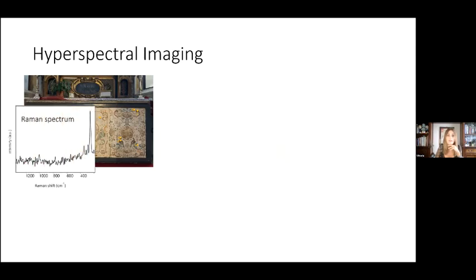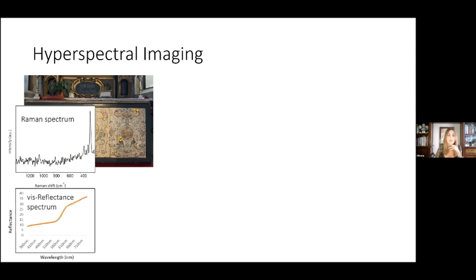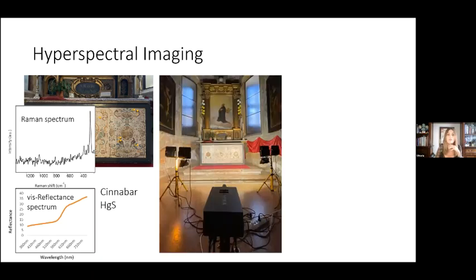While the human eye has receptors only for three colors, blue, green, and red, hyperspectral imaging measures the continuous spectrum as a function of the wavelength of the light for each pixel X, Y of the scene with fine spectral resolution. The collected data form the so-called hyperspectral image, that is a three-dimensional data cube as a function of X, Y, and lambda.